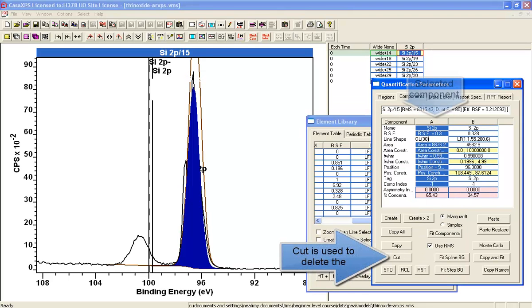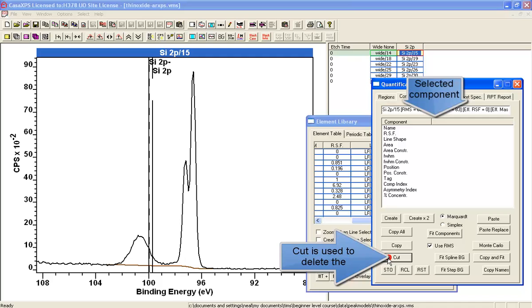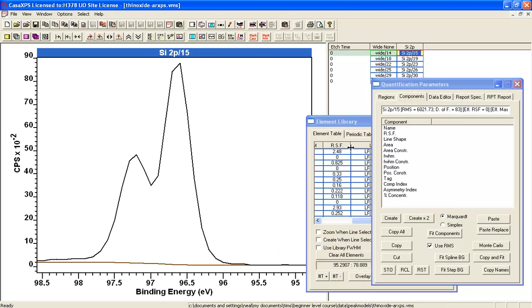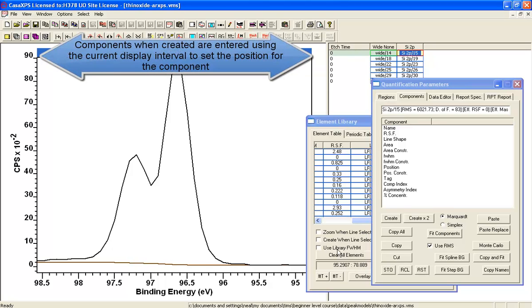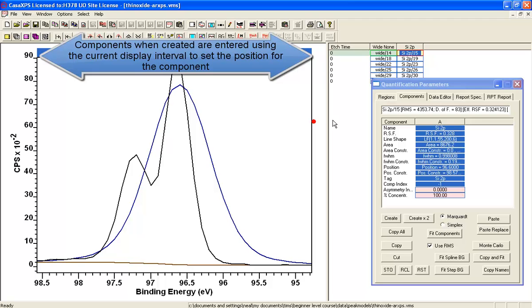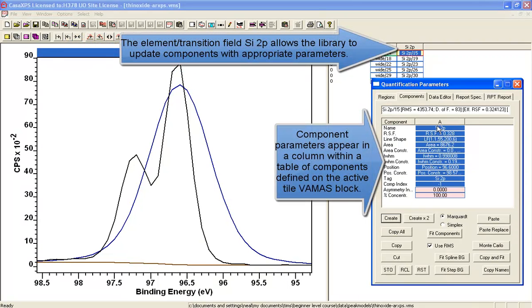Let me just delete these and start again. So what we want to do is create, after defining a background, a line shape, and we don't need that up anymore so we'll close that. The reason I don't need that anymore is because the element transition field has been assigned correctly, so the element transition field is being used to pull out the appropriate entry in the element library when I create a peak.